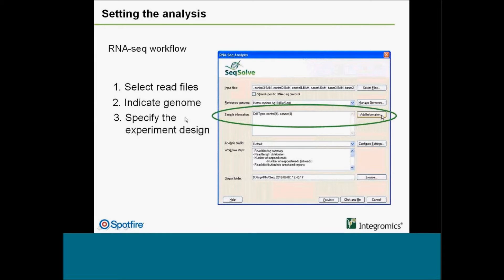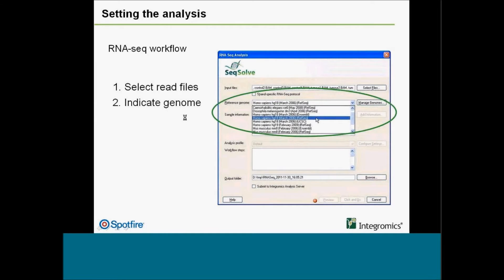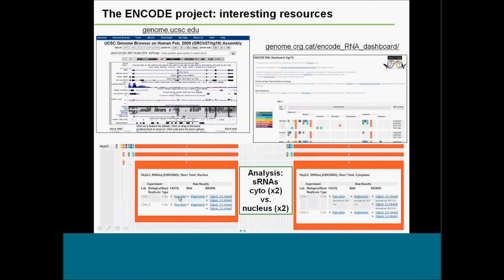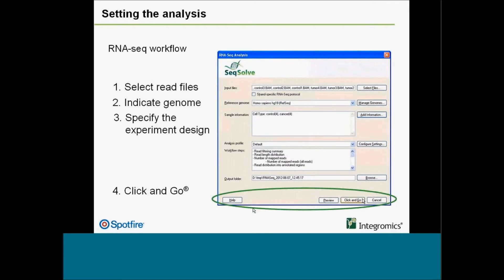You specify the experiment design: you have two files assigned to a group called cytosol, then you create another group called nucleus and assign the two other files there. That's as simple as this — that's all you need to do. Once you do that, you hit what we call the click-and-go process, which automatically uploads and processes all your data according to the experiment design and generates all results set up in the analysis profile.